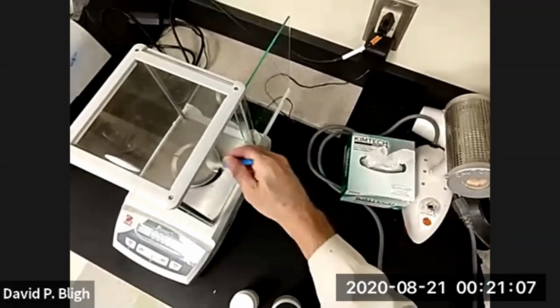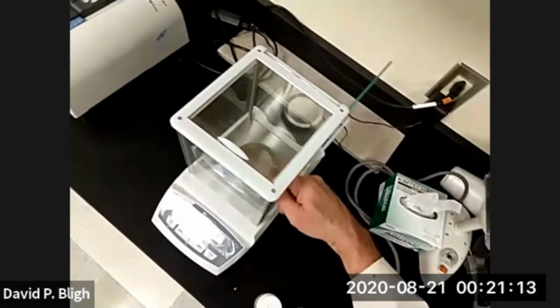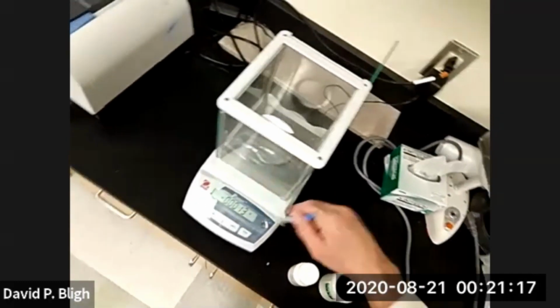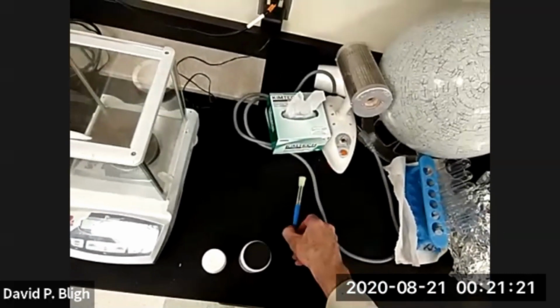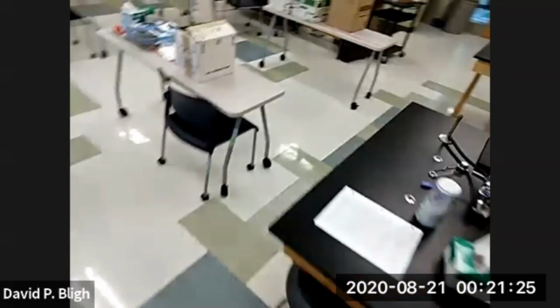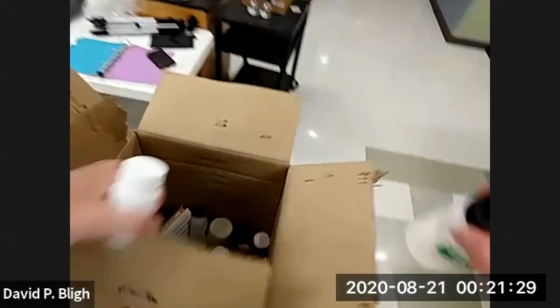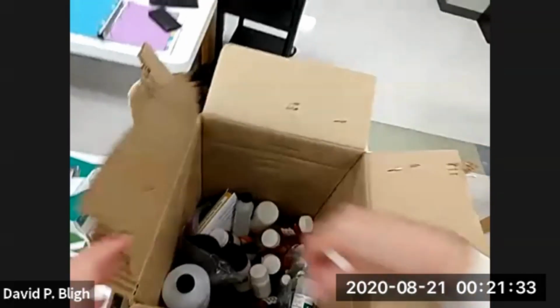A clean balance is a happy balance. And I'll put these away for future use in another location, actually.